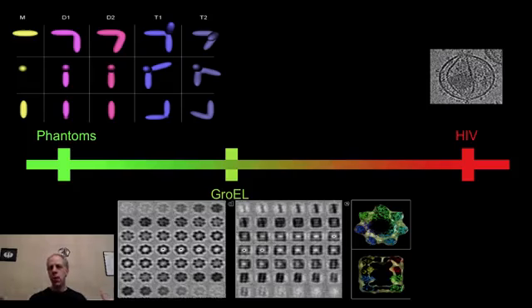So what you do in most image processing, but in particular when you're talking about medical imaging, is you go slow. First, you start from what are called phantoms. You create three-dimensional shapes that look like viruses from your prior knowledge. You add noise, you project them, you make missing wedges, so you make them like they were acquired in the microscope. And you run your algorithm on that. You know the ground truth because you created it. You hope to reconstruct. Until you finish that, you don't move on. So you solve this. You say, great, I put different structures, phantoms I created. I rotate, add noise, add missing wedge. I got them back. I'm happy.